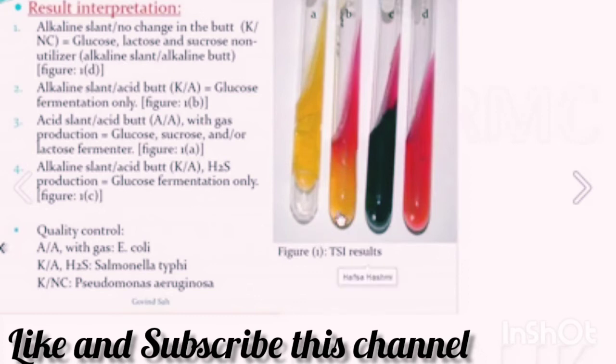Here is an acidic butt, an alkaline slant. Acid slant and acid butt with gas production: glucose, sucrose and/or lactose fermenters. This one. Alkaline slant and acid butt, H2S production, glucose fermentation only. This one.